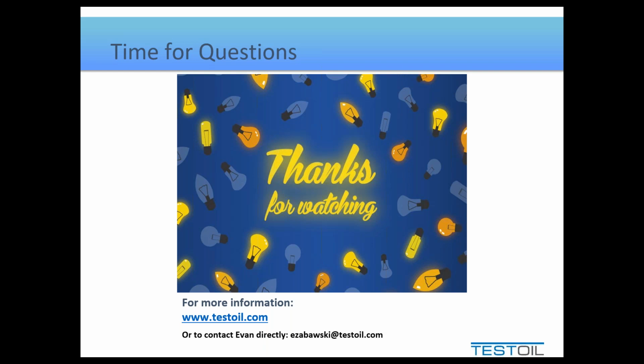So we tend to favor ICP over, say, AA and rotating disc electrode, but we just use standard ICP. We don't get to mass spec levels of ICPs. One, it's a very expensive instrument, and two, it's just more time consuming per sample. So from a throughput perspective, I don't think any lab would really have a significant ability to analyze for those forms.